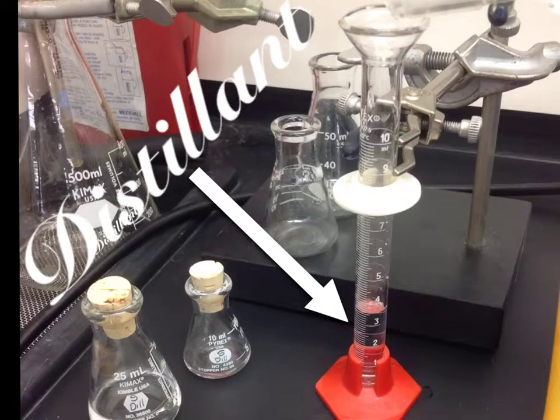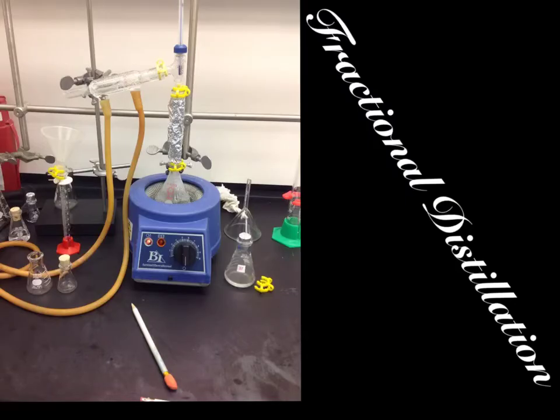A total of 15 milliliters of distillant was collected, and the temperature was recorded for every half milliliter increment. To achieve a richer distillant, the fractional distillation method was used. This method introduced a fractionating column filled with glass beads to the apparatus.